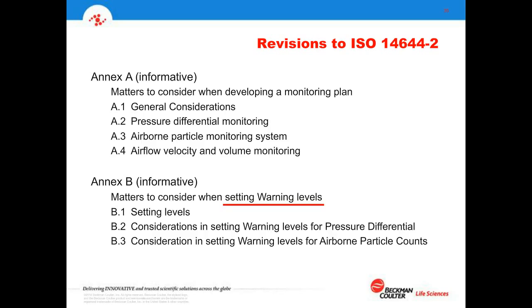But realize that when you deal with pressure differential as well as airborne particle counts, often you need to think about your warning limits in a different way, because for both pressure differential and airborne particle counts, you have instances where there's elevated or notable changes, yet it's part of the normal activity. For example, in pressure differential, when you open a door in a room, the pressure is definitely going to change, be it a positive or negative one, for the short term that the door is open, and then ideally it returns back to the previous level. And you don't want an alarm to occur for what is a significant change in pressure. The same might be true when you consider airborne particle counts in a certain region. An activity might increase the particle count level momentarily, but it's part of the normal process.